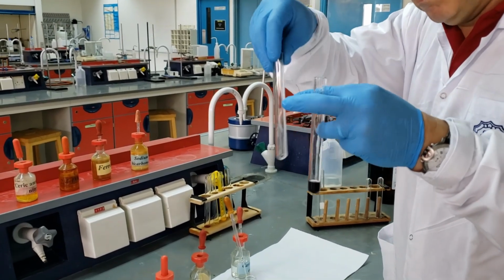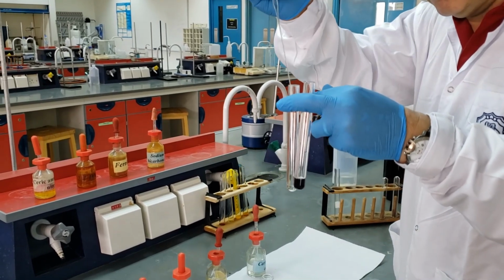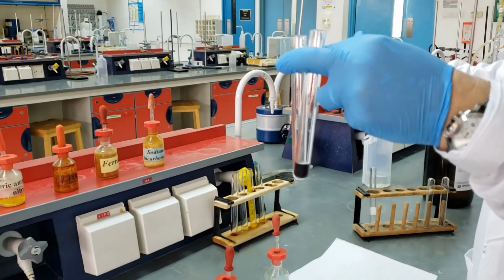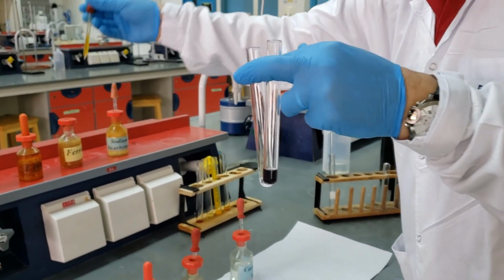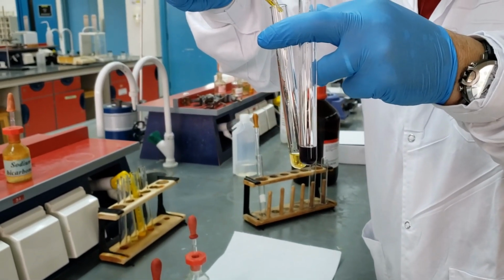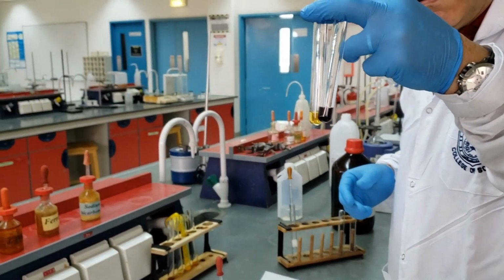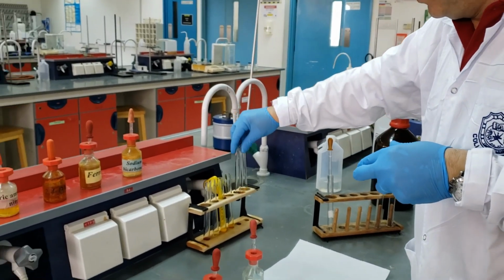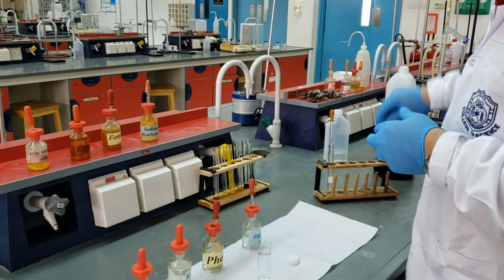We add 1 milliliter of our unknown compound. Then we add the same few drops of ferric chloride, and we see the result here does not match, which means my unknown compound does not contain a phenol functionality. So we keep continuing until we find a match, as we said before.